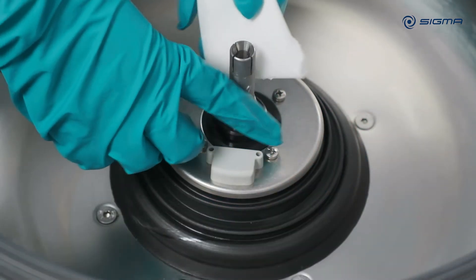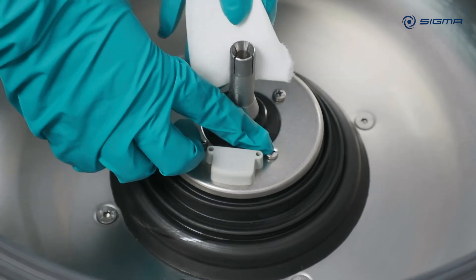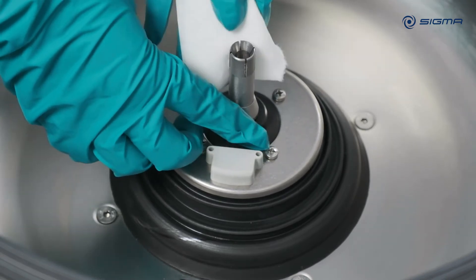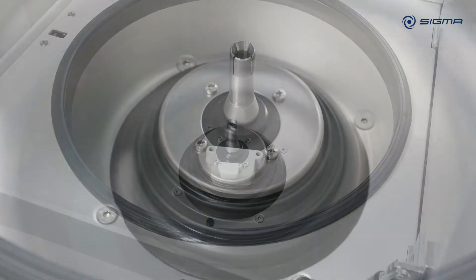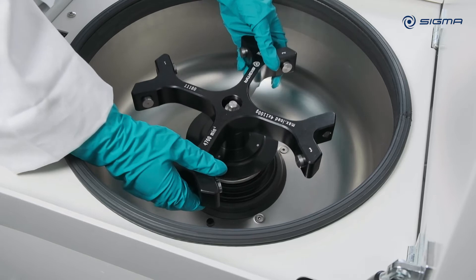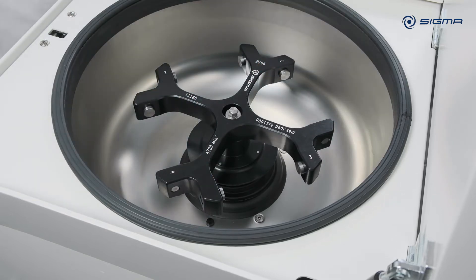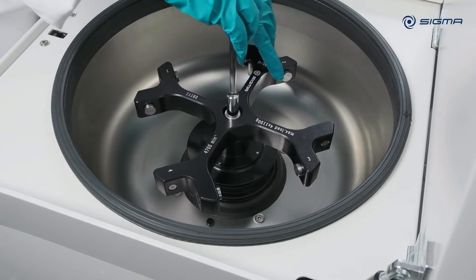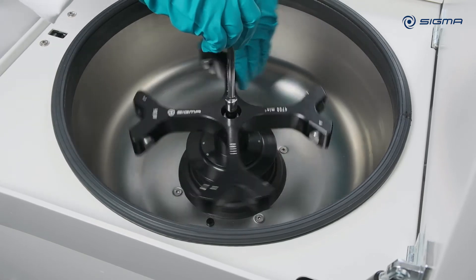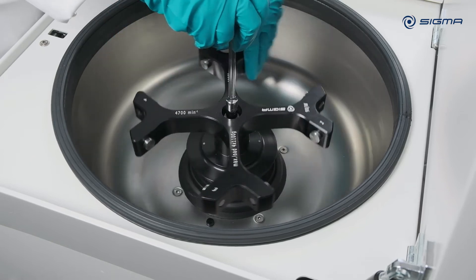After cleaning, lightly grease the motor shaft with a small amount of pin grease applied with a cloth. Tighten the rotor tie-down screw clockwise with the supplied rotor wrench. With heavy rotors, you should use a torque wrench for tightening.